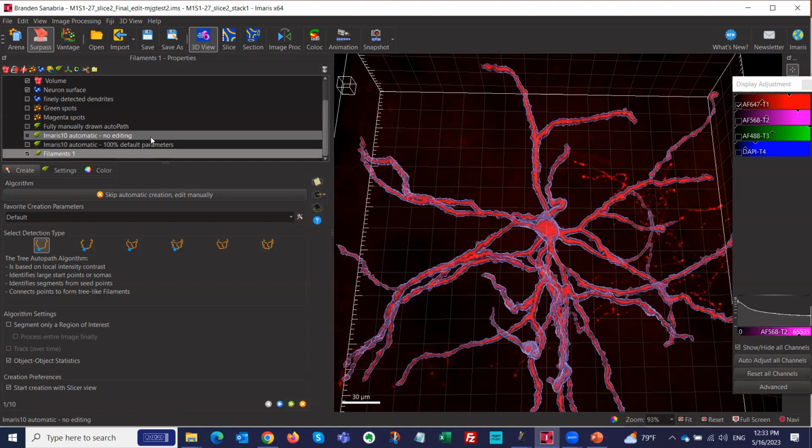So the faster the clock speed, the faster your filament trace, but sequential. Now it's using multiple cores, parallel computing, making it much faster. Okay, one of the big differences: faster.